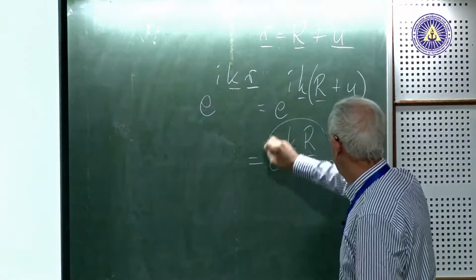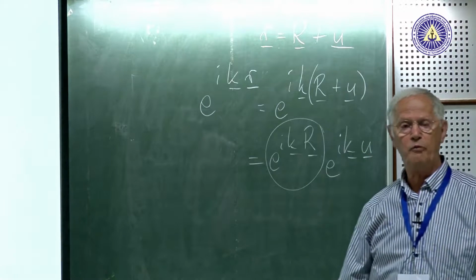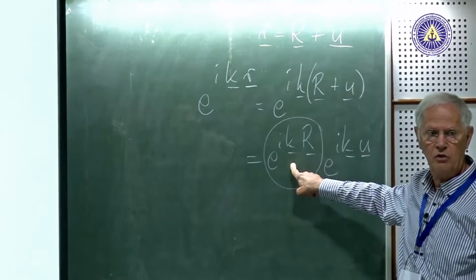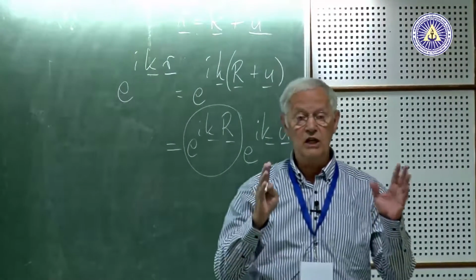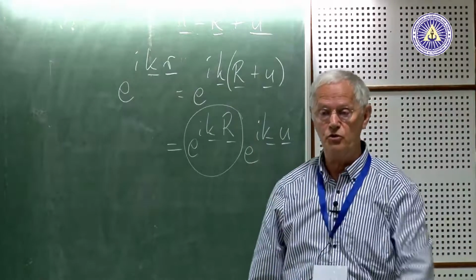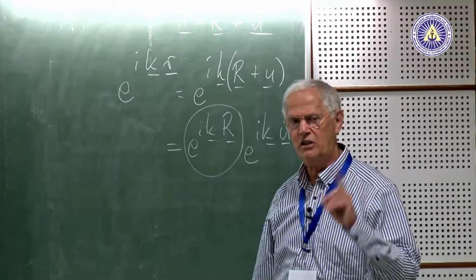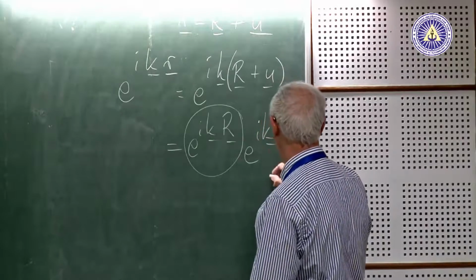Now, this part is just the Fourier transform of your perfect crystal into reciprocal space. So this gives you the exact Bragg positions, the first term. Okay? Because if your crystal is perfect, then within the kinematical scattering theory, you have infinitely sharp peaks in each Bragg position. That is actually one of the faults in kinematical scattering theory. But we don't care about that. What about this?